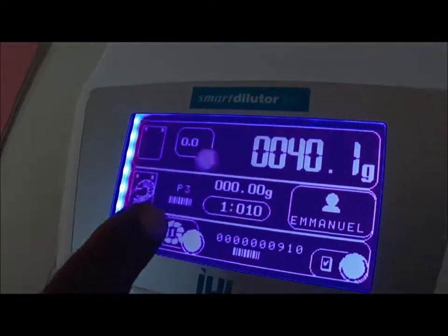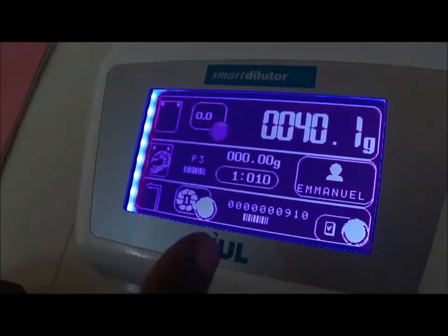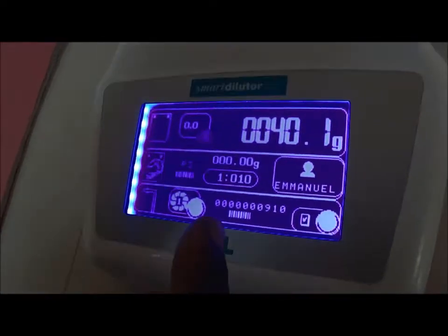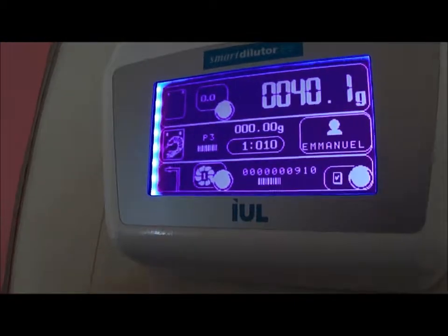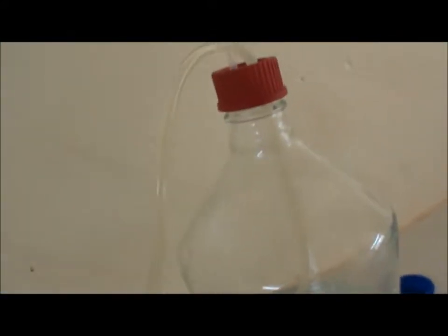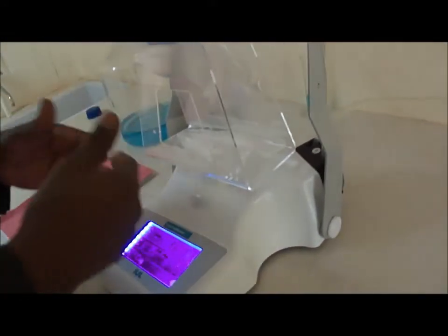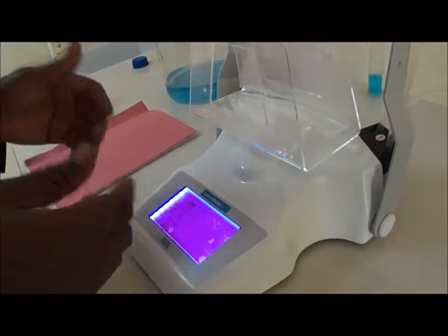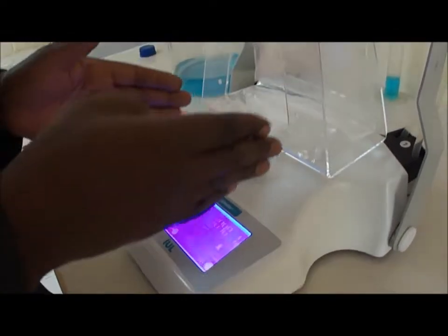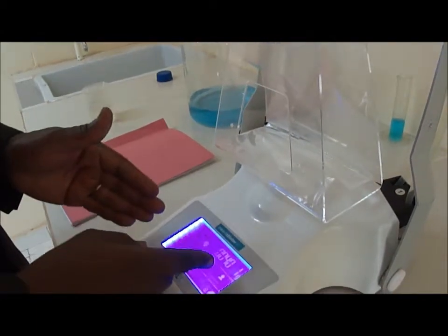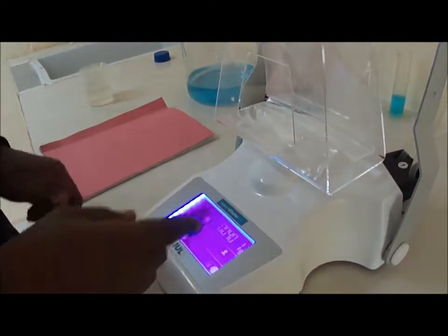Then, since I have a dilution factor of 1 over 10, normally, it will add, from pump number 1, that is selected here. This is, the pump number 1 is this bottle, this one, where I have my diluent, my diluent. And then, it will mix with my sample, according to the dilution factor. I guess, if you have one volume here, or one weight, it will add 9 weight. Then, we should have something around 400 grams, in this case.